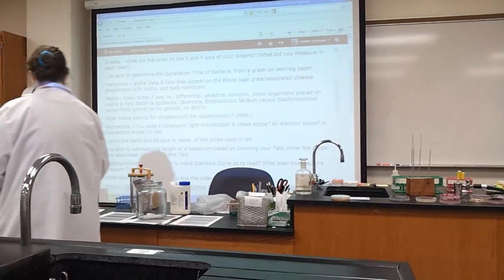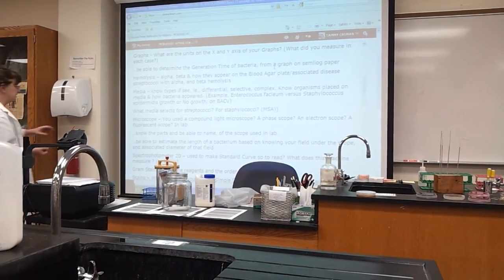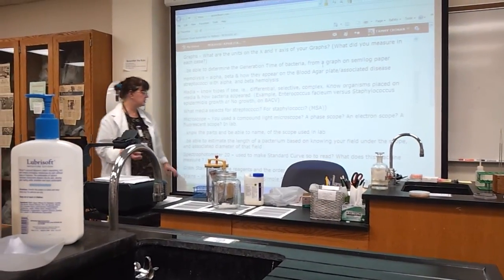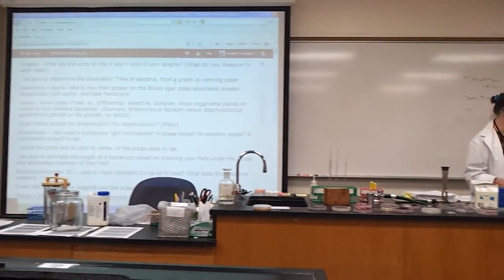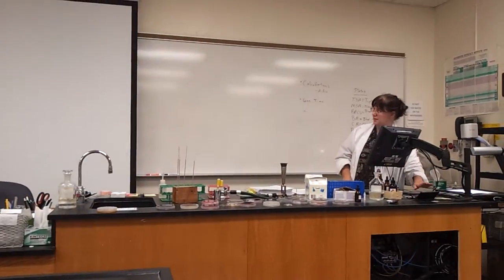Okay? Now, you did what selects for staph, what selects for strep. I want to switch. I'm also trying to bring back things that were a long time ago, because they're still there.